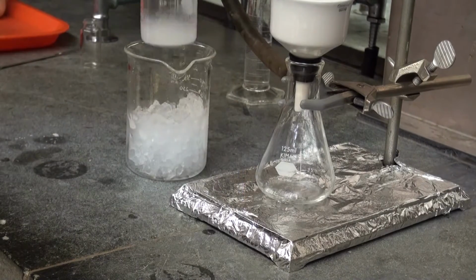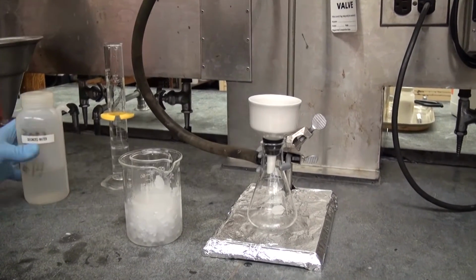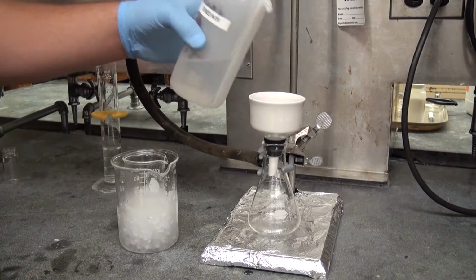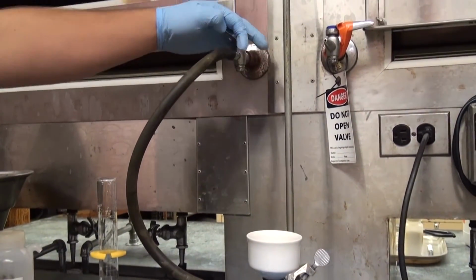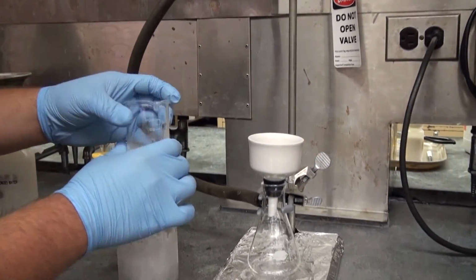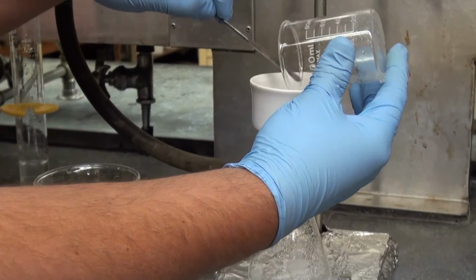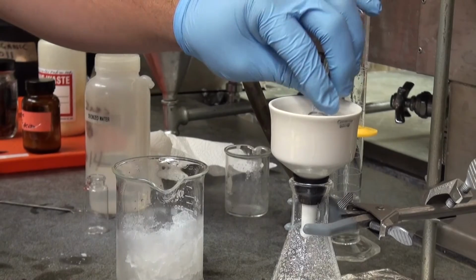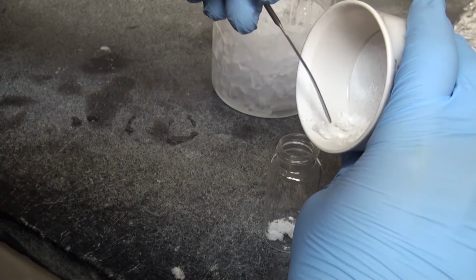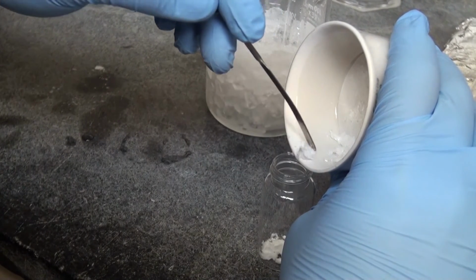Then cool the solution in an ice bath. Collect the crystals by vacuum filtration of the ice-cold solution using a Buchner funnel with a filter paper. Make sure to wet the filter paper right before you start the filtration. Scratch out as much of the crystals left over in the flask as possible with either a rubber policeman or a spatula. Wash the crystals with 1 or 2 milliliters of cold distilled water and transfer the crystals to a tared vial and let the benzoic acid air dry for at least 1 day.